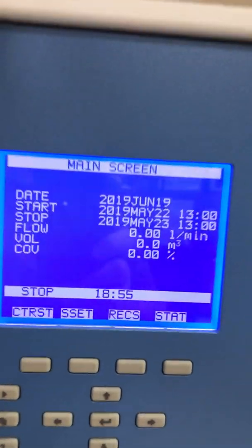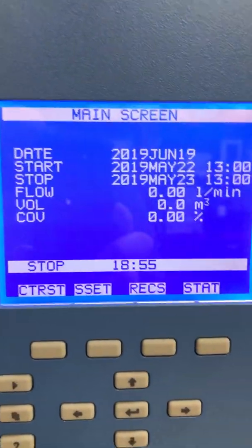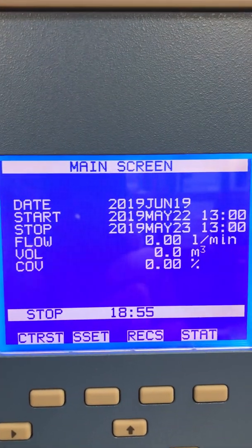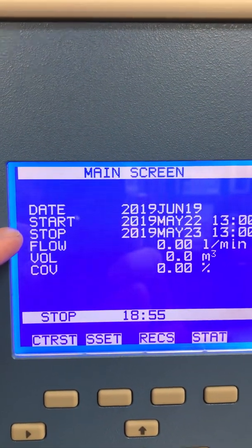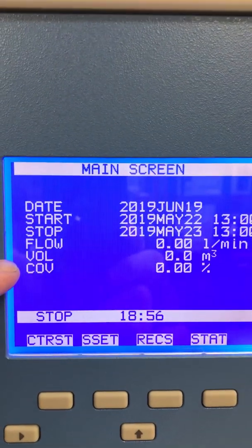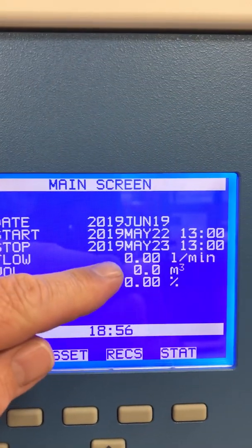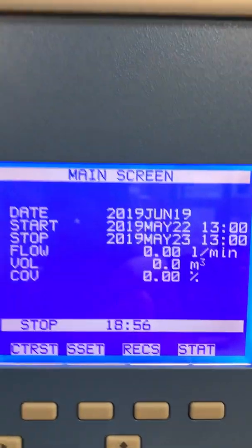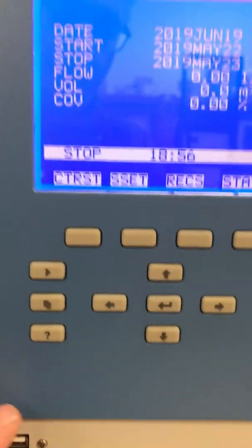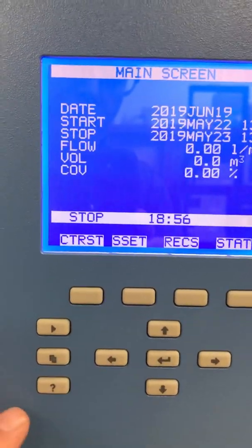Looking at the menu — this is the main screen. There's a date, today's date, start time, stop time, the flow, and volume. You can see it's all set to zero right now, so it hasn't done a run. It's in stop mode right now. To set this sampler up, there's a multitude of keys here.